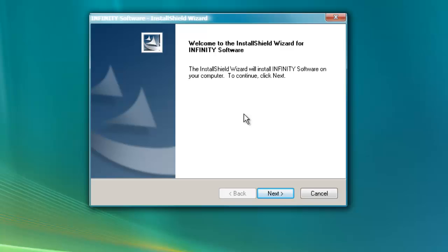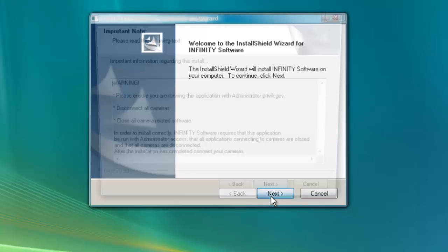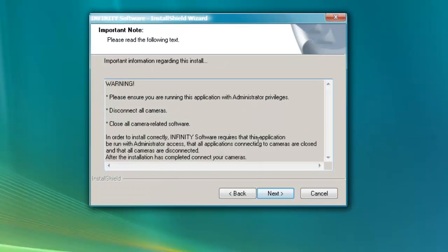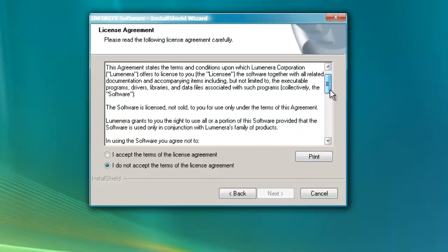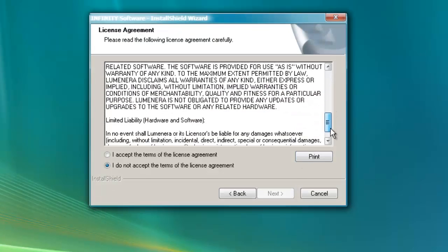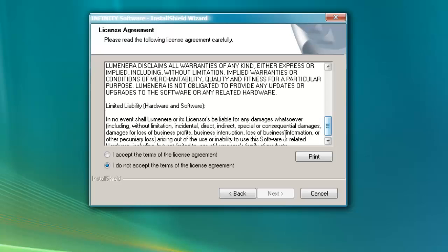Let's get going. This screen reminds you to make sure you're logged in with administrative privileges and the camera is unplugged. This screen is the license agreement. Review the agreement. Select I accept the terms of the license agreement and continue.